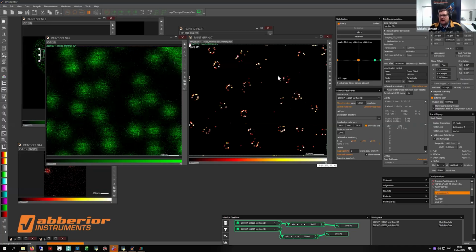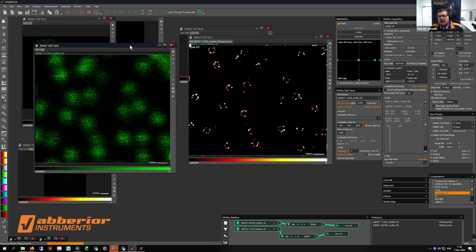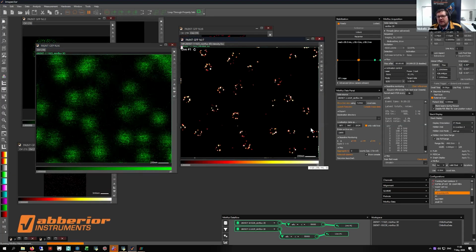We are here now with our 3D measurement. It is running now for 20 minutes. And as you see, we already got a lot of different localizations in the live view, and we're able to visualize a lot of the parts of the nuclear pore.